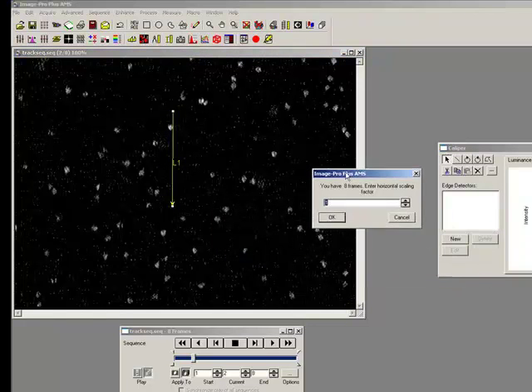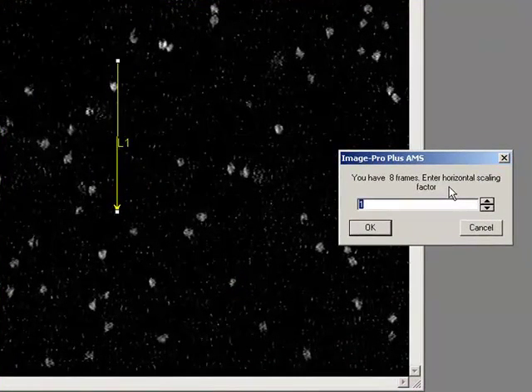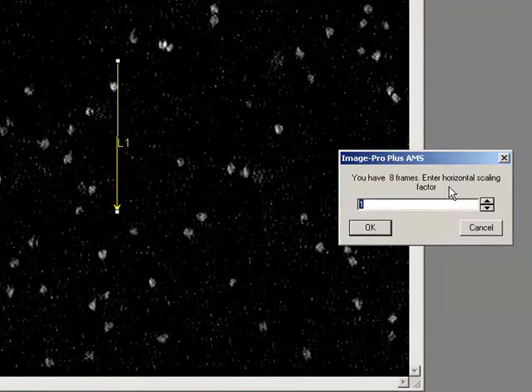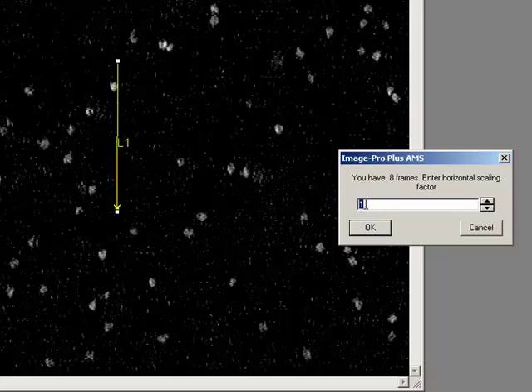Now here you have 8 frames, enter the horizontal scaling factor. If I create a kymograph now, I'm going to create an image that's that long by 8 pixels, one for each frame. So let's do that. But if I wanted to have 16 pixels wide, a bigger image, I could do that by setting scaling factor to 2.